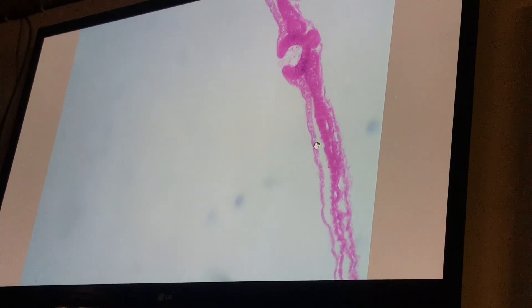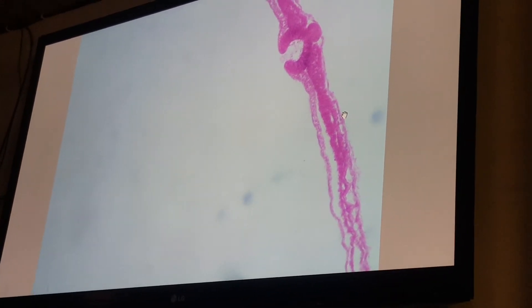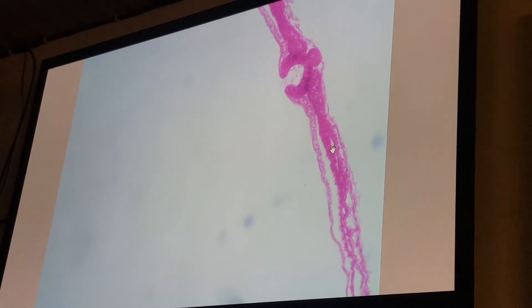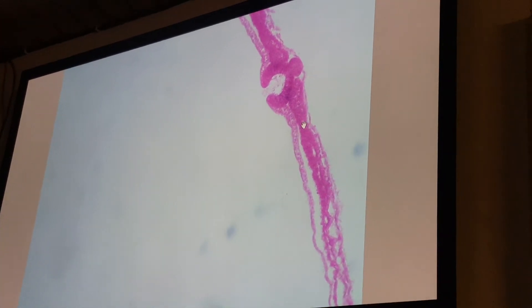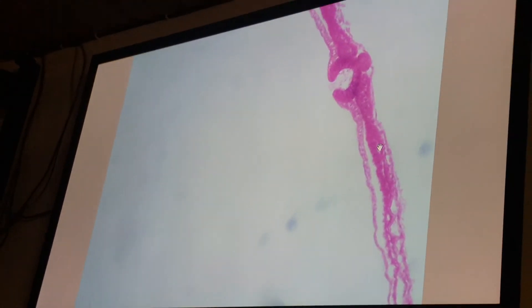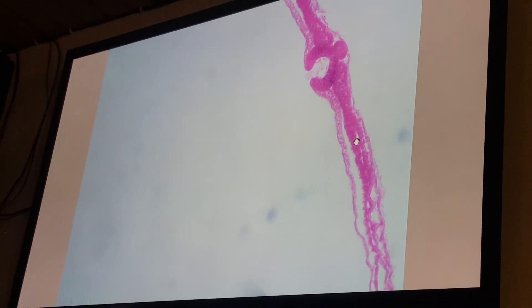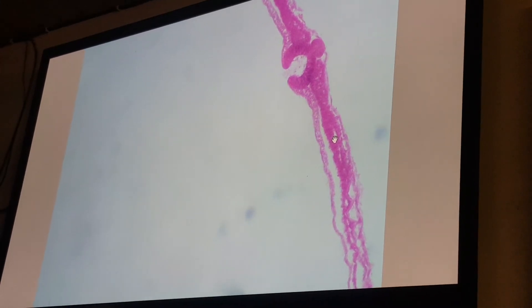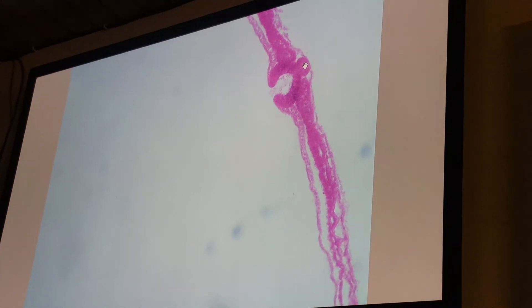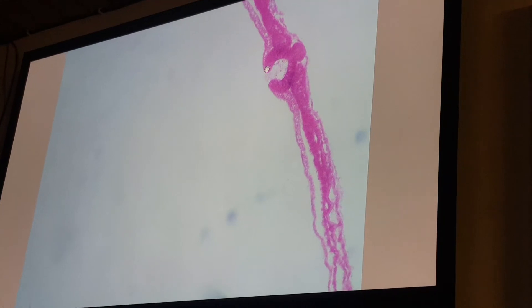Somatic adjacent to the ectoderm, visceral adjacent to the endoderm. The other cavity is intraembryonic cavity. Paraxial mesoderm, intermediate, somite, lateral mesoderm visceral, lateral mesoderm, and intraembryonic cavity. This is ectoderm, endoderm, notochord, neural groove, neural fold.